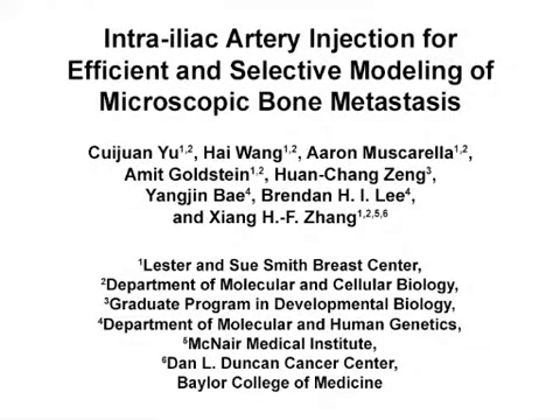The overall goal of this procedure is to establish experimental bone metastasis by delivering cancer cells directly to hind limb tissues, including the bones, via intra-iliac artery injection. This method can help answer key questions about breast cancer bone colonization, especially in the early phase of this process — how breast cancer cells interact with the microenvironment cells in the bone.